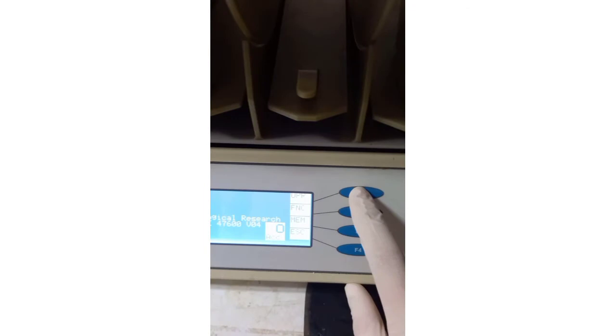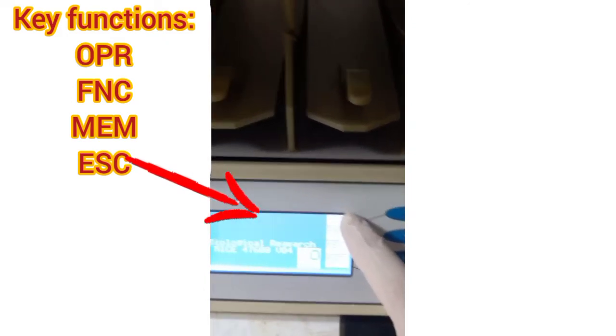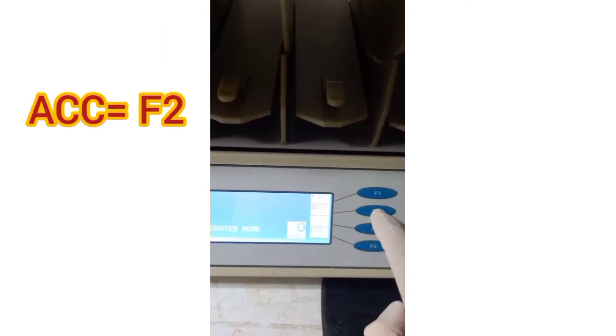First, you need to turn the rotarod on. You can find the on/off switch at the back of this model. As soon as the instrument is on, key functions will appear vertically at the right of the display. Using these key functions you can set different parameters. If you select F1, operation will be activated, and with the mode function you can select speed.